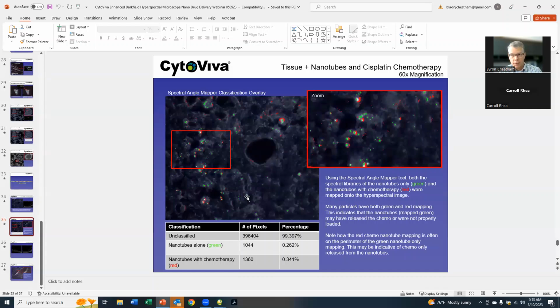We do have some limited experience. For example, we're all aware of mRNA vectors, the ones that were utilized for COVID vaccines, and we do have experience looking at lipids with mRNA on them. That's data that we can't share here, but the mRNA will change the optical spectrum of the lipid. It is a difficult lift with this technique, but we have seen some success with it before.